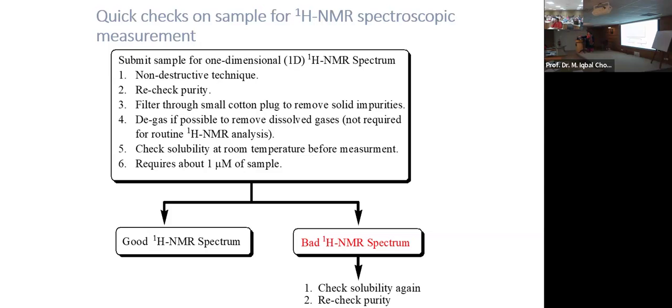When you give a pulse, the magnetization comes to the xy plane and just keeps moving until it goes back. Whatever you do, there is a relaxation phenomenon, going back to its original state. Until that time, you can manipulate the magnetization vector. So you have so much time available to design your experiment and play with your magnetization vector, your M naught. That is only possible in NMR, which is why it's very fascinating.